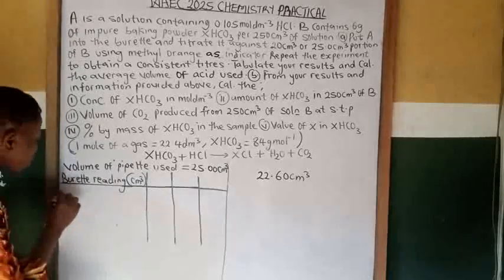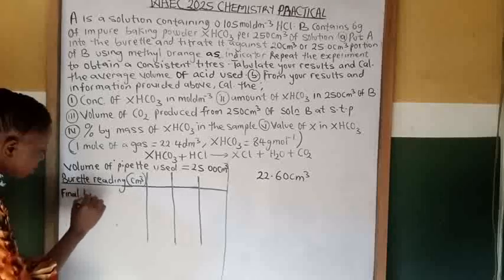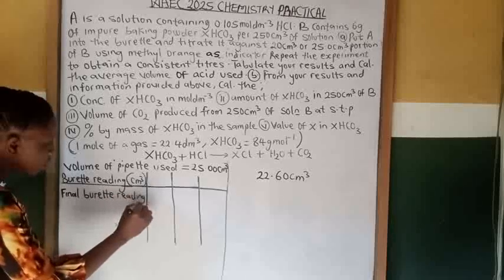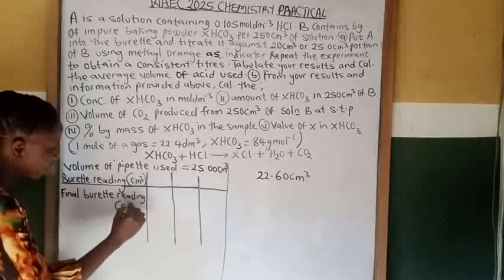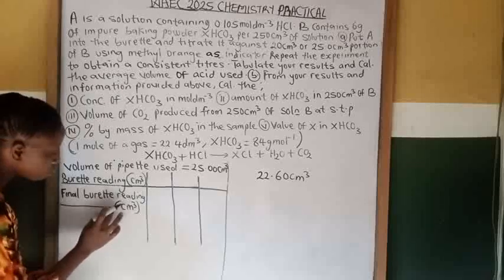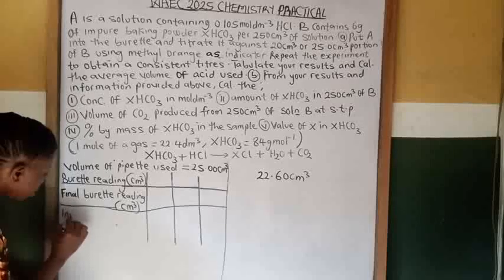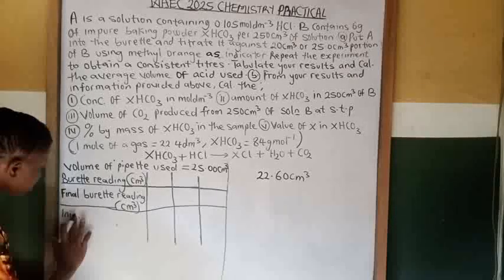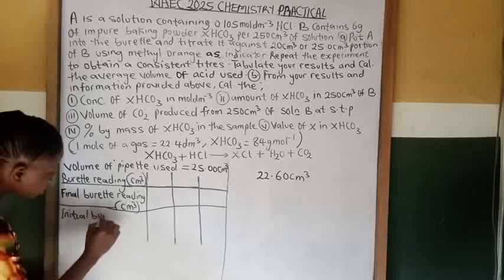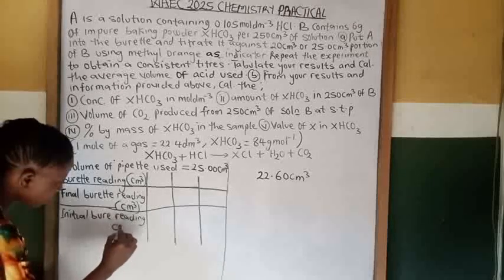Then burette reading is followed by the first stage, which is the final burette reading, in centimeter cube. Then it is followed by initial burette reading in centimeter cube.